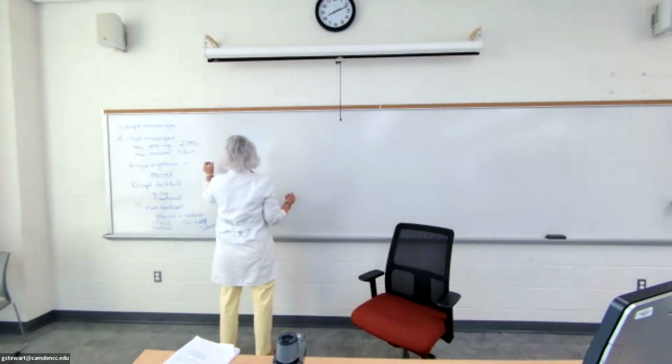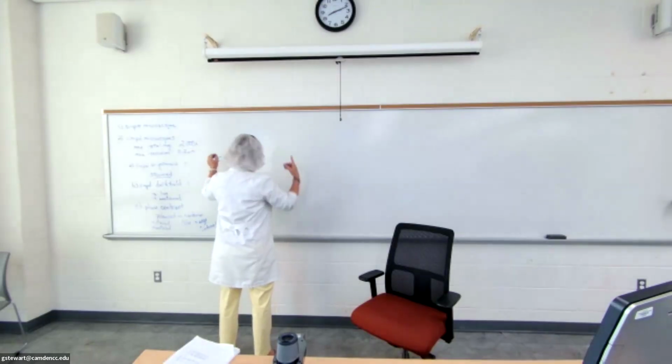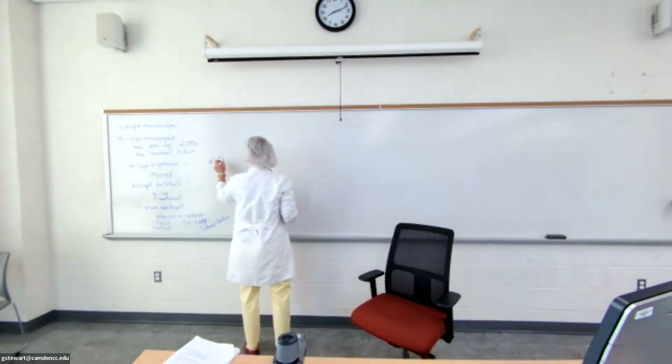I'm going to go ahead and put D on here, put the fluorescent microscope on here, fluorescent microscopy, before we look at the pictures again.